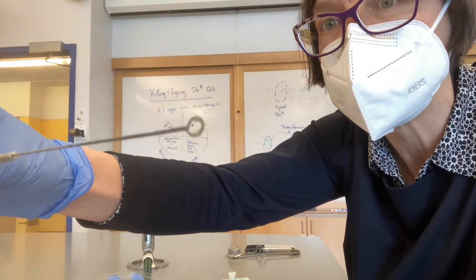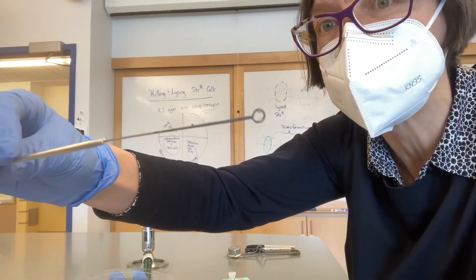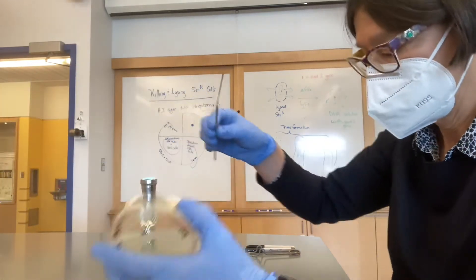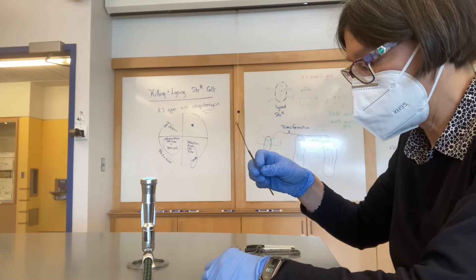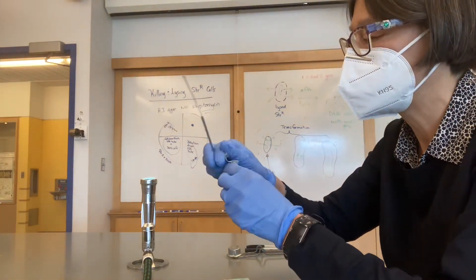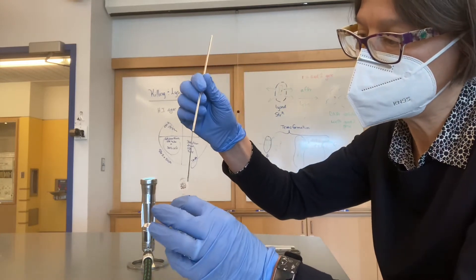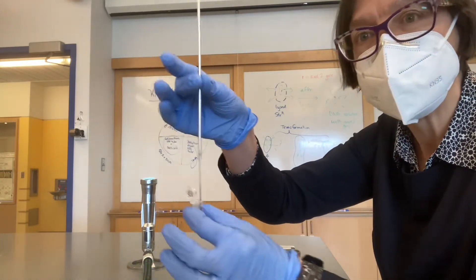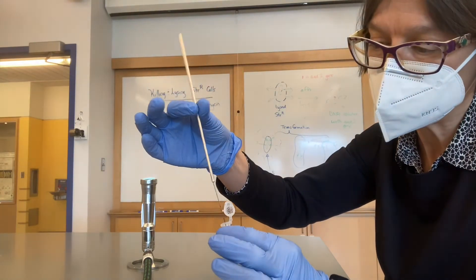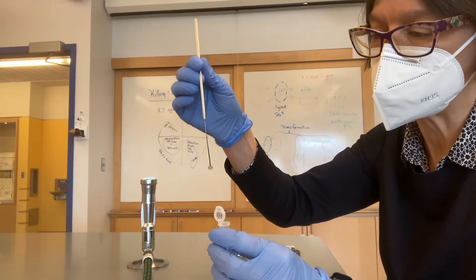I don't know if the camera's going to actually focus on that, but there are some cells there. They're white and filmy, and then I'm going to dispense them into this tube by putting the loop in and doing this kind of twiddling. It shakes all the cells off into the tube.